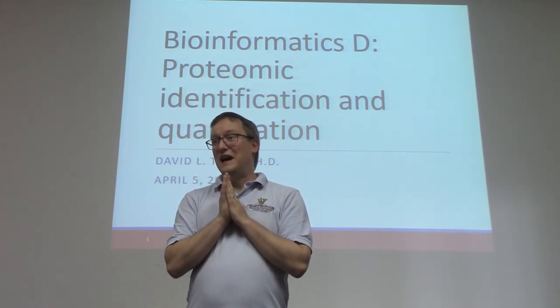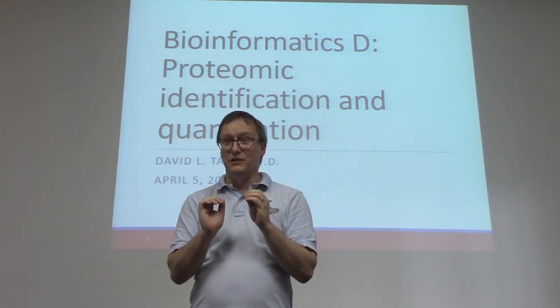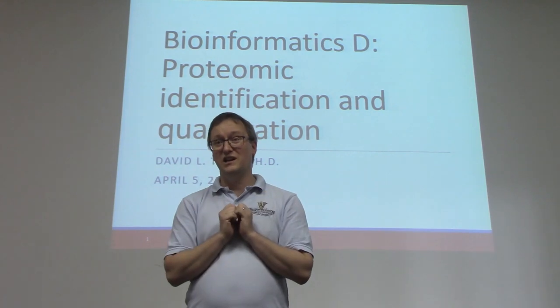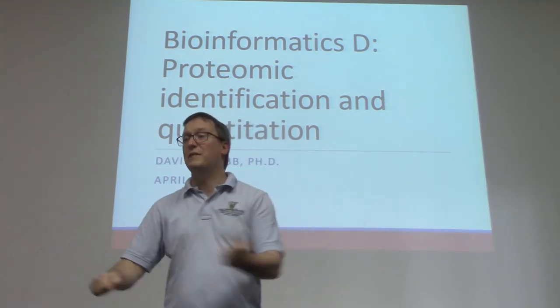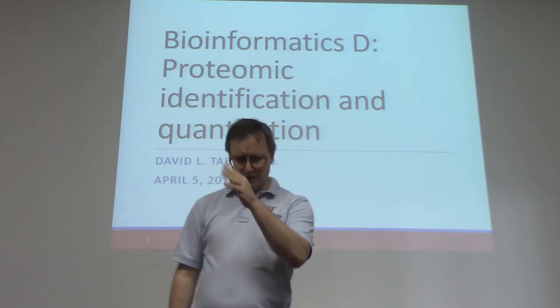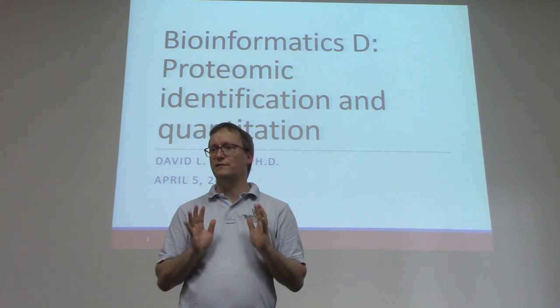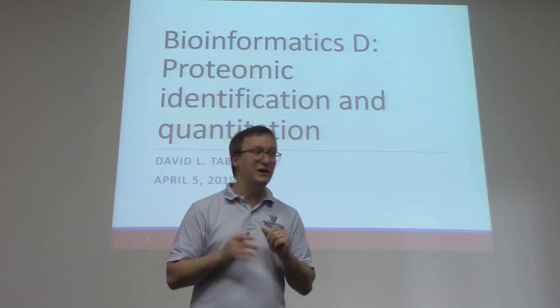So I've seen where all the bodies are buried along the way, and I'll try to remember that you may be encountering tandem mass spectrometry for the very first time today. If you catch me bumbling off into jargon land, feel free to just haul me right back and say, now what was that again? All right, so we're going to try to cover the basics of how we identify peptides and thus infer proteins. It's going to be really interesting.